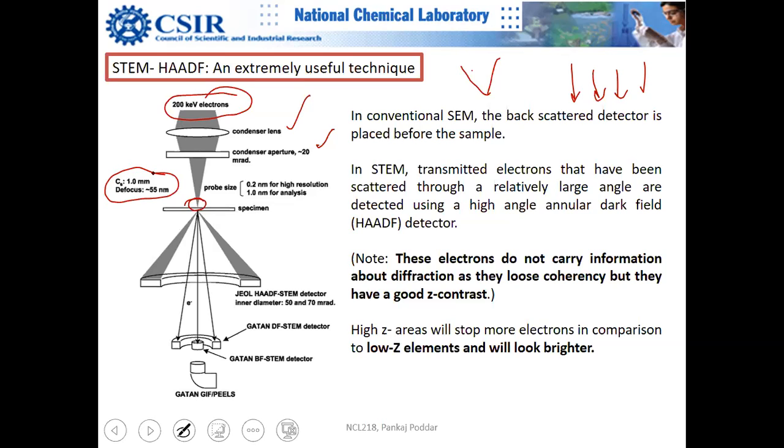In TEM or STEM, the difference between it and your mobile phone camera imaging, or your regular SLR, is that in geometric optical imaging you get the best image when you focus on the object in the object plane. But here you are getting the best image when you are defocused.